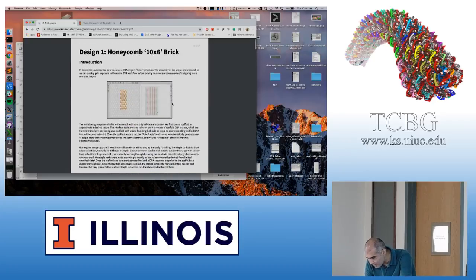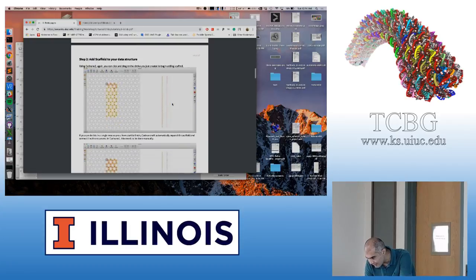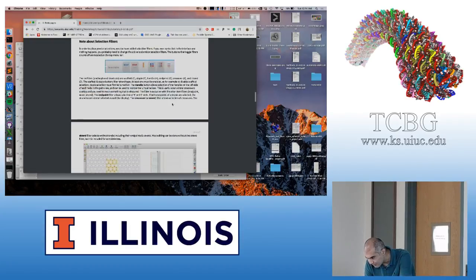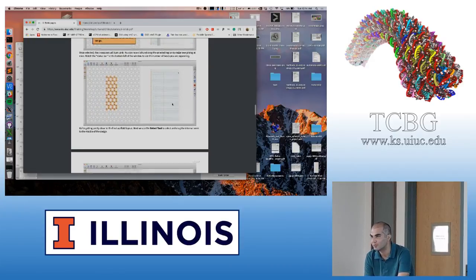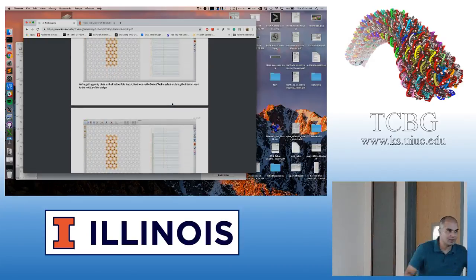First example, okay. This is making the design first. It's just using the CaDNAno first part. In the new image, you just type cadnano2 on the terminal, and then you get CaDNAno 2 to work, because yesterday people were having issues getting it.